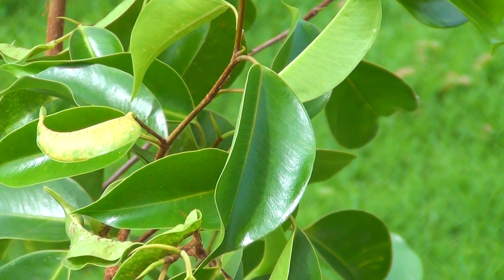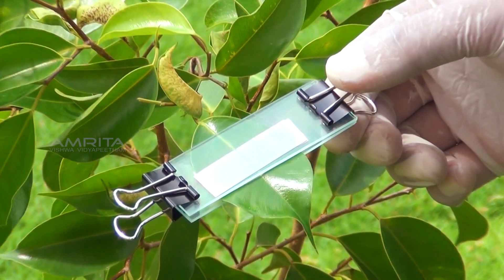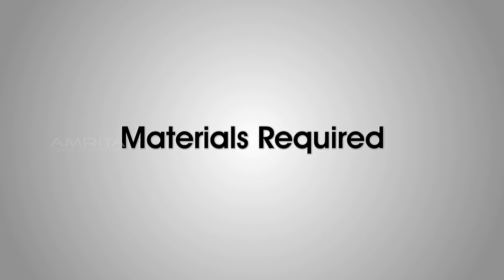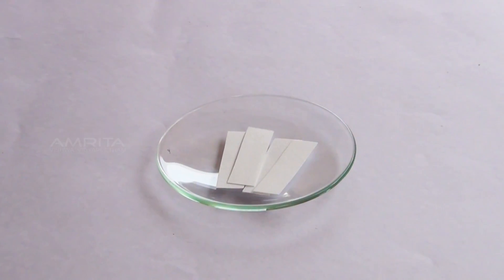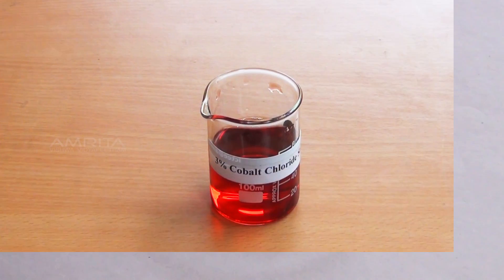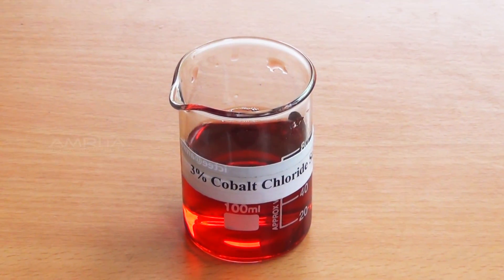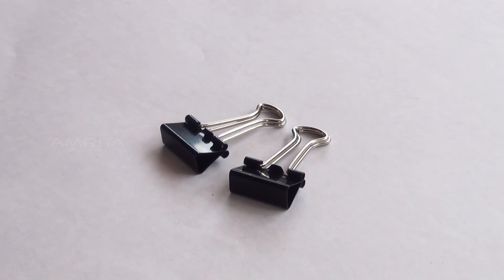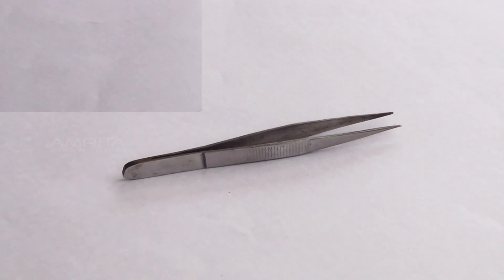Rate of transpiration can be easily demonstrated by the cobalt chloride paper test. Materials required: a potted plant, filter paper strips, 3% cobalt chloride solution, glass slides, binder clips, Petri dish, forceps, and a watch glass.